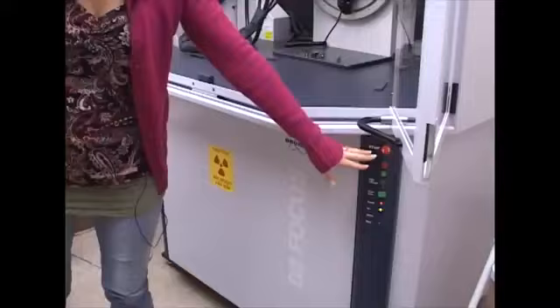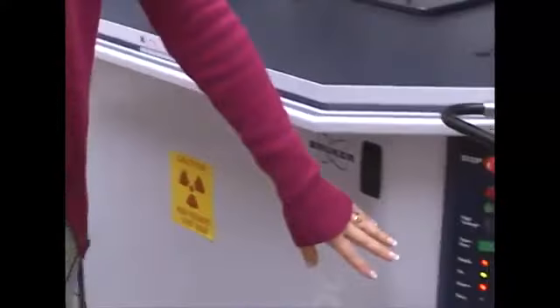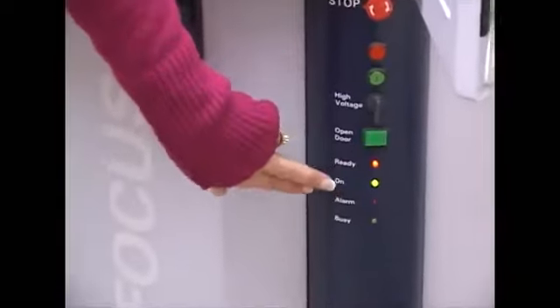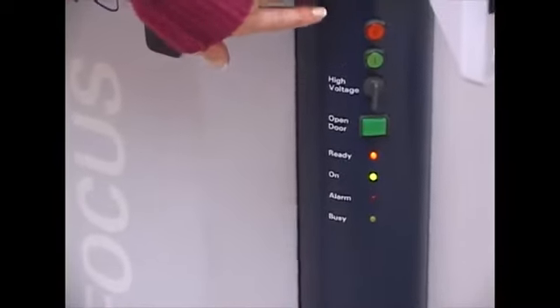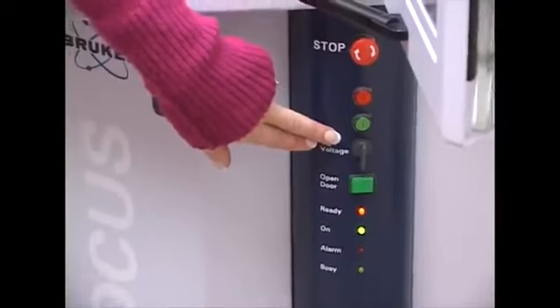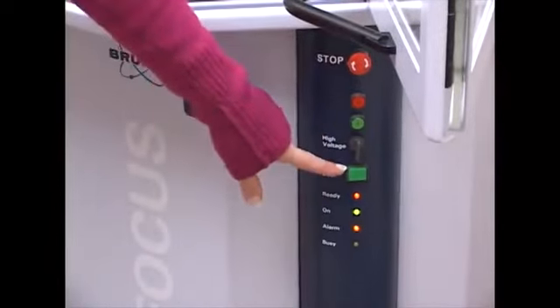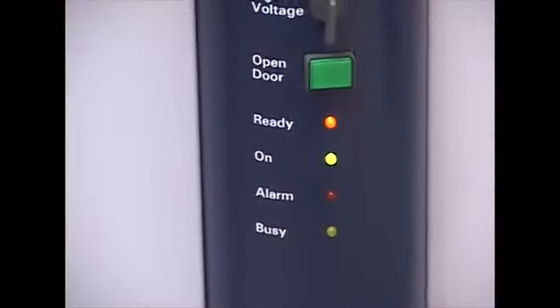If the door is not correctly closed, it will cause the safety circuit to trip and it'll shut everything down. There's a control panel here and the exact same set of control panels over there. And there's LED lights that say ready, on, alarm, and busy. They're all important to note what state they're in. These buttons up here you must never touch. The only button that you ever want to push on this panel is this big green square button, and that's the door open button. To make sure you've done it properly, just look down here and verify that the alarm LED has gone off.